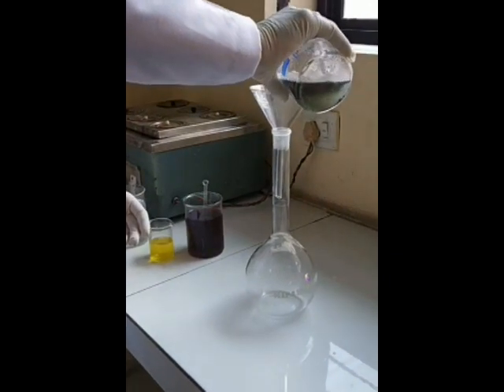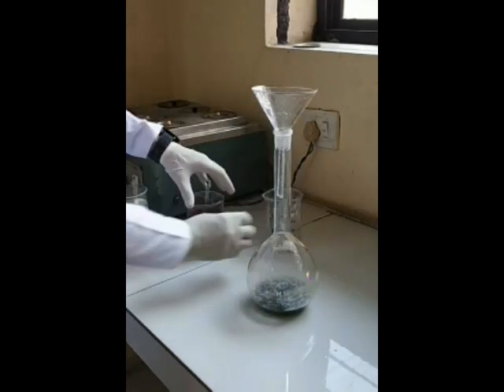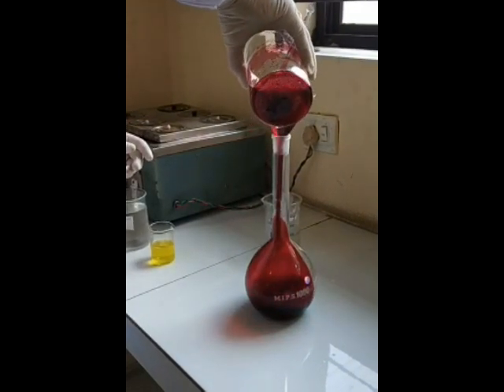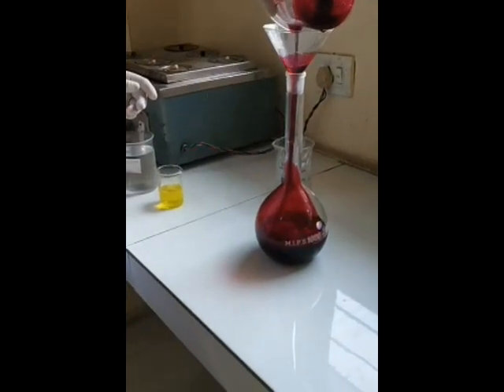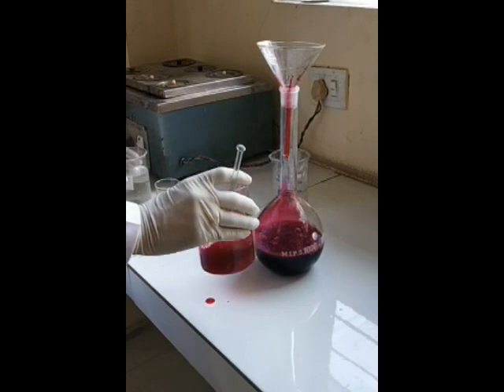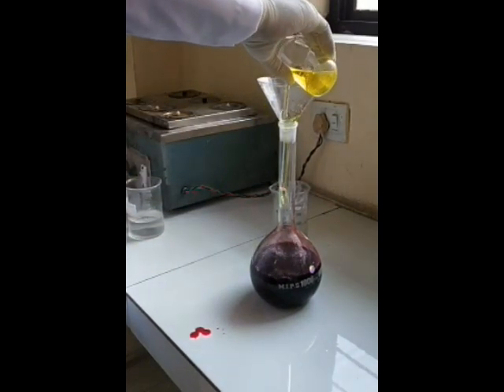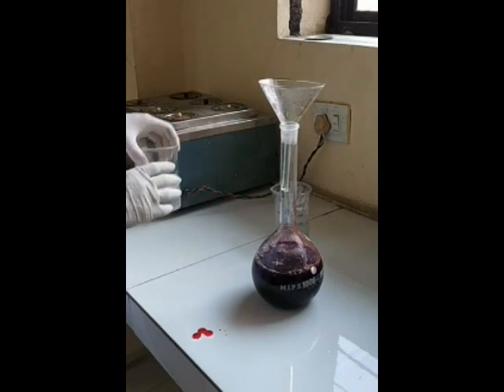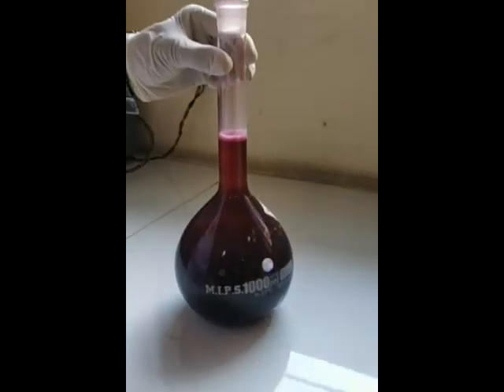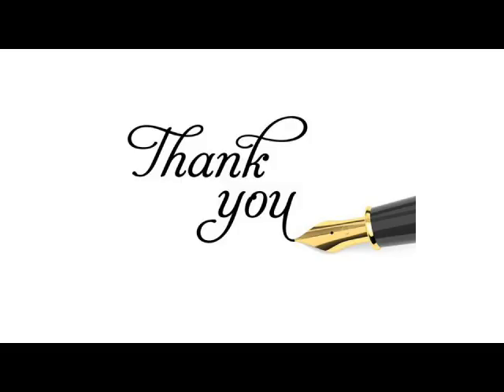In the last step, combine the filtered solution prepared in step number two with the colored cochineal and sugar solution. The strainer is washed. Then orange flavor oil is added, and the final volume is made up using purified water to 1000 ml. Your compound syrup of ferrous phosphate is now prepared.